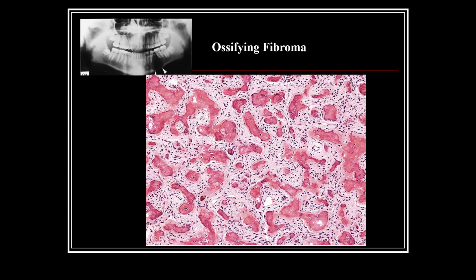Now, the differential here, of course, would be things like osteosarcoma, but the cytology, the very low-grade appearance, and the radiographic sharp margins and so forth should alert you to the more benign lesion.